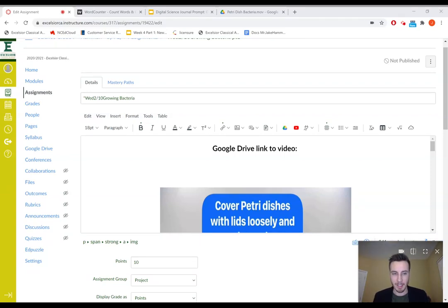Welcome back to 7th grade science. Today we'll be doing the growing bacteria assignment. We're actually going to be using our science boxes for this assignment.